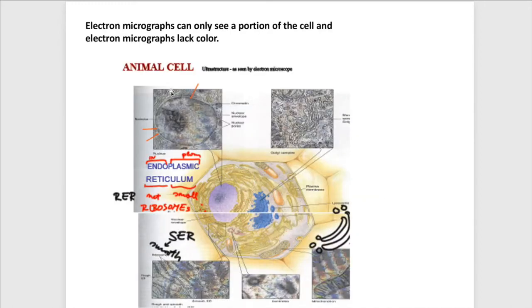I can look at cells, but with the transmission microscope I can only look at a part of the cell. I can't back it up to look at the whole cell because it's just too big. I can't fit it in there. But I can see all these other organelles, these little membrane-covered structures, these little oblong things, and little circular things. Now I can figure out what a healthy cell looks like, and by looking at these structures, I can tell what this cell is capable of doing.